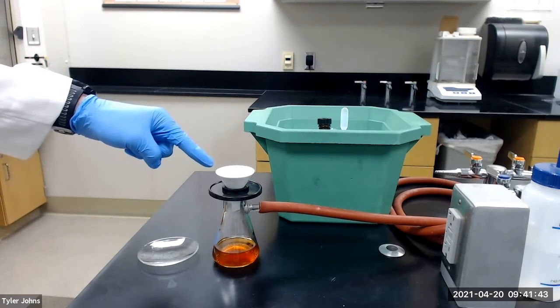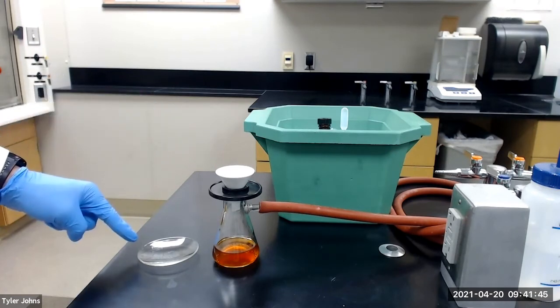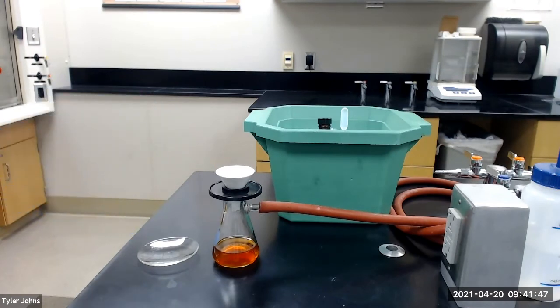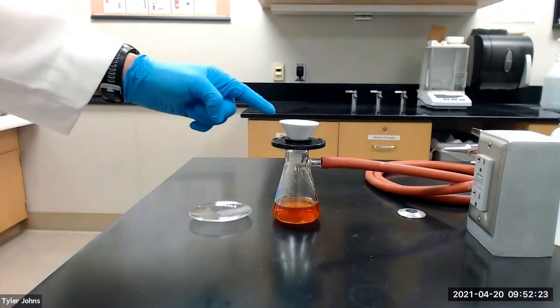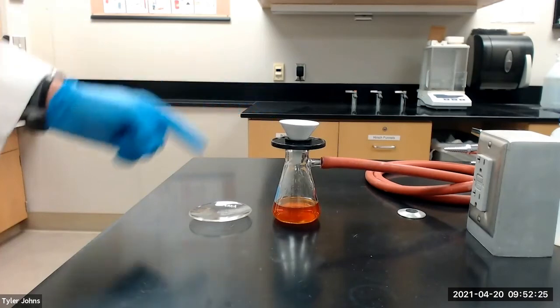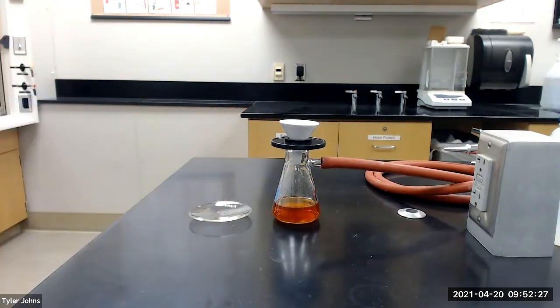While our crystals continue to dry, we will next pre-weigh a watch glass. The mass of the pre-weighed watch glass is 35.4472 grams. We will next collect the substituted chalcone on the pre-weighed watch glass and dry in an 80 degree Celsius oven for 10 minutes.